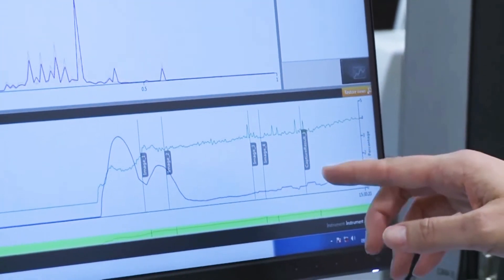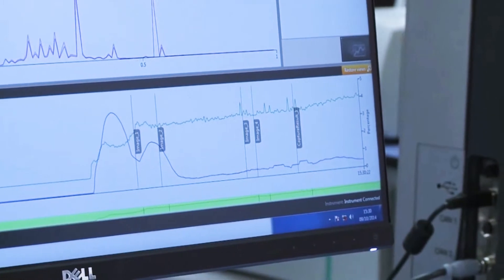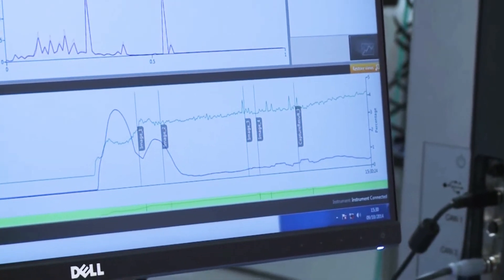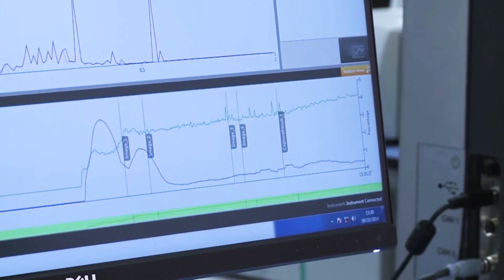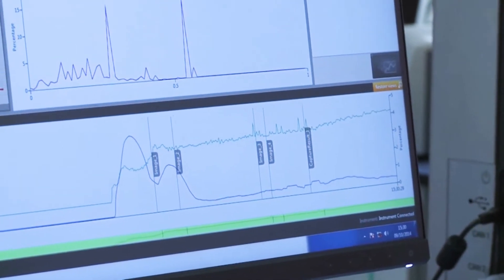The dispersion index is a measure of disorder. So as the particles disperse and we get more particles, the frame essentially becomes more disordered, and so we see a change in that dispersion index.